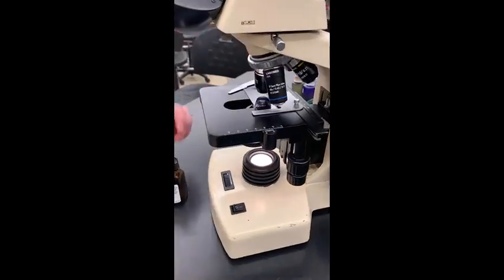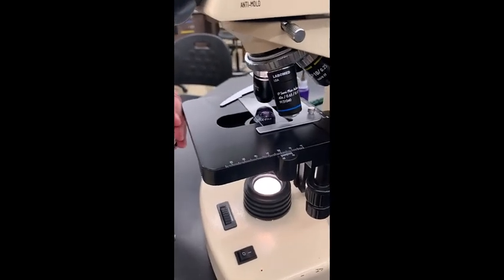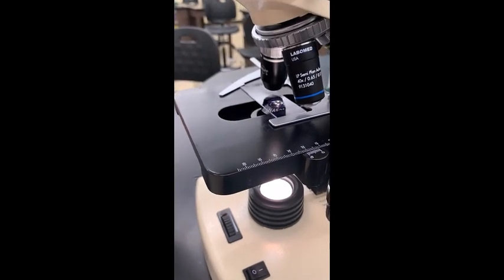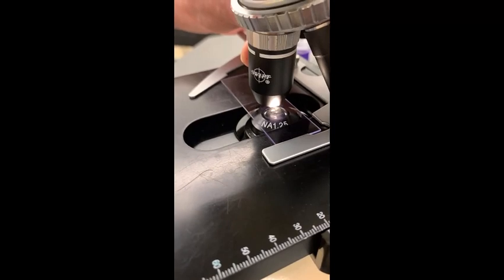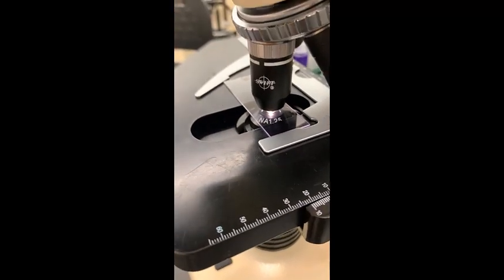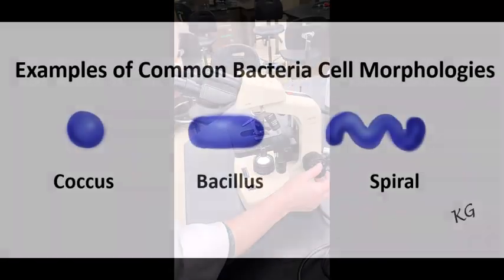Rotate the head and apply the oil immersion directly to the smear. And now focus the smear under oil immersion. Individual cells should be present.